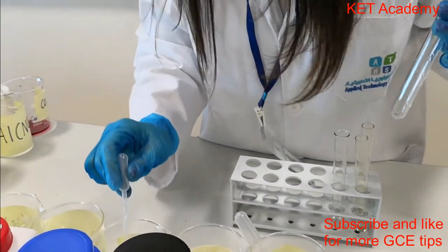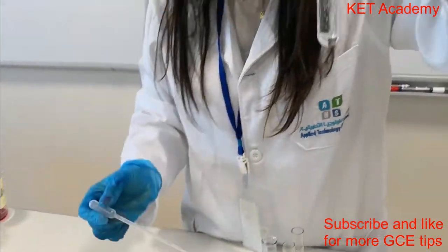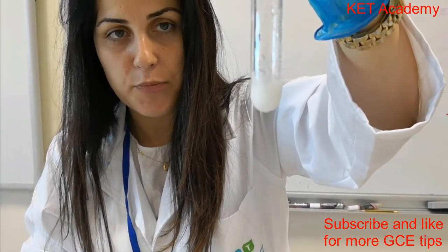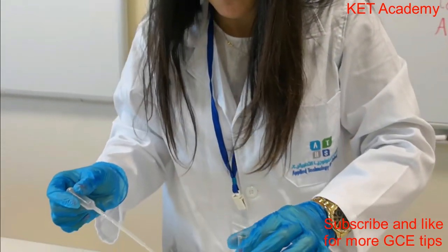Let's try calcium. This is calcium with the hydroxide, a white precipitate. So we will do another test for this to identify the calcium.